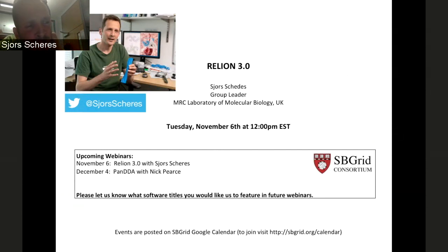In practice, we have not encountered many cases where that actually yields a big improvement. Perhaps that's why we never published it. So in practice, we often just refine in C1, and you can then still average over the symmetrical copies afterwards to make them better. But inside the iterative refinement, it often doesn't really help. But it might be that your case is the first.